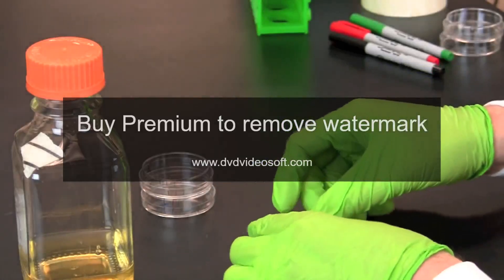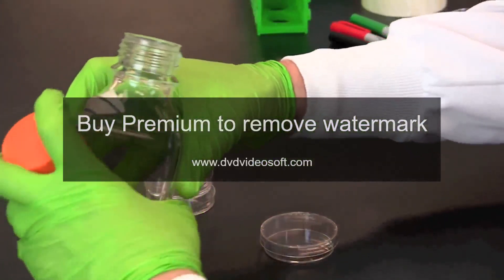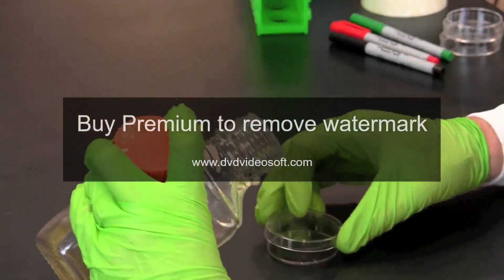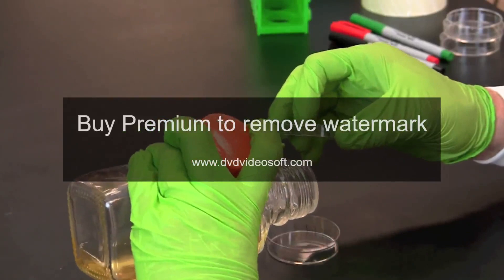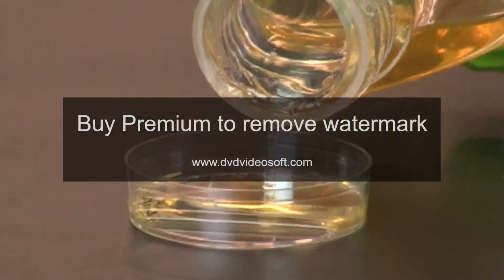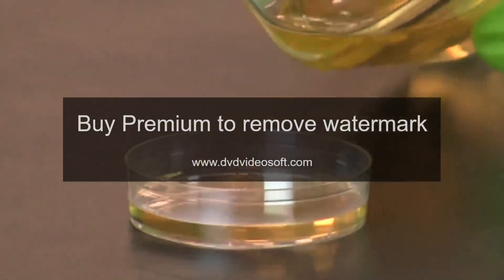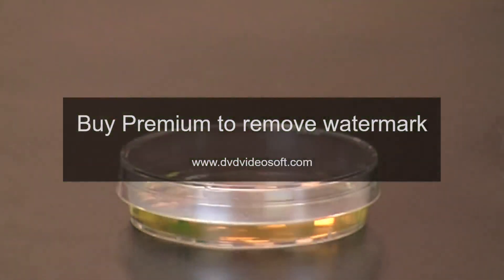To pour a plate, turn the plate with the base on the bottom. Use aseptic technique and hold the lid of the plate to shield the base against contamination while pouring the LB agar. Add enough agar to cover about one half of the bottom of the plate, then allow the agar to flow and cover the whole plate. Make sure the plate is about one third full.